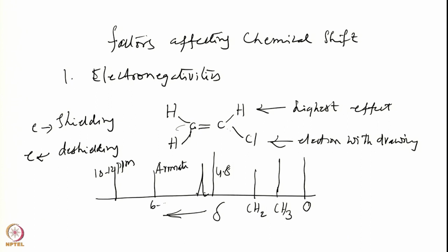So these are around 6 to 8 ppm. Then you will have here the amide groups, things which are attached to nitrogen, amides, these will appear in this area up to 10 ppm, and various kinds of other protons will appear in this area. So therefore, depending upon the structure of your molecule, you will have different electronegativity effects coming, and this will get relayed into the chemical shift at different positions, the de-shielding or the shielding effects. I am only listing here some of the very important parameters.